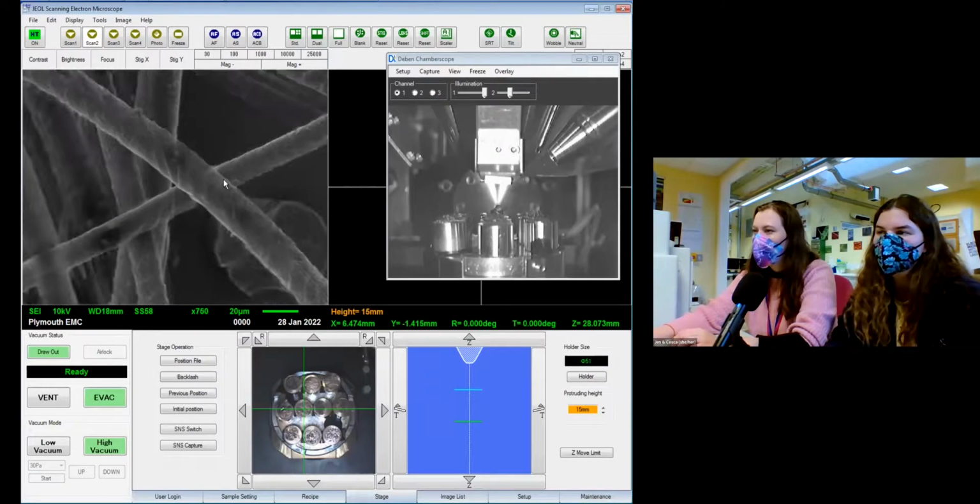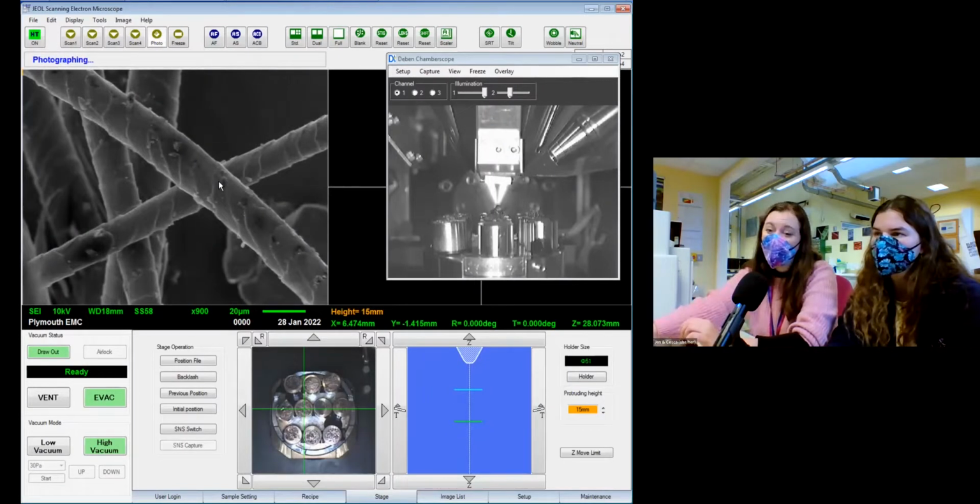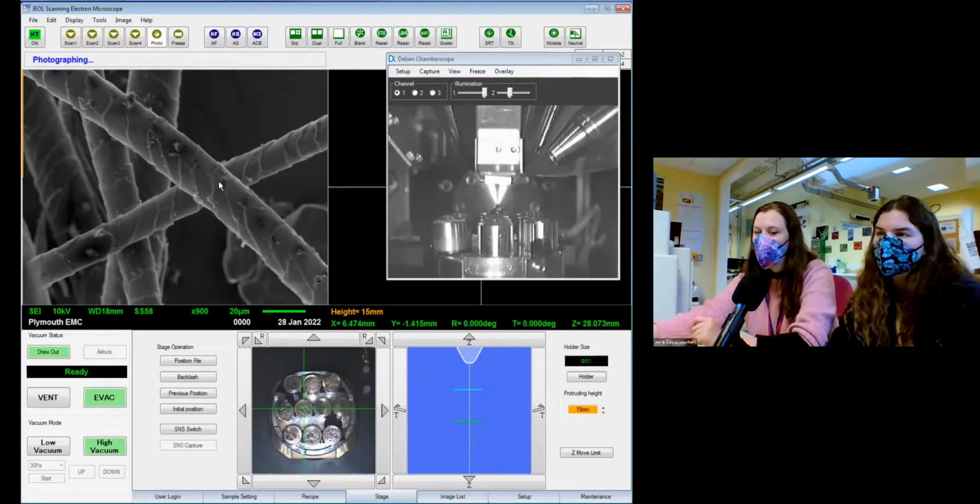Well, there we go. That's about right. So this is some hair from my dog Laszlo. He is an 11-year-old Irish setter. I managed to grab this off him when I went home for Christmas. This is his very outer coat, not the nice, smooth, shiny orange bits. This is the fluff that he uses to keep himself warm.